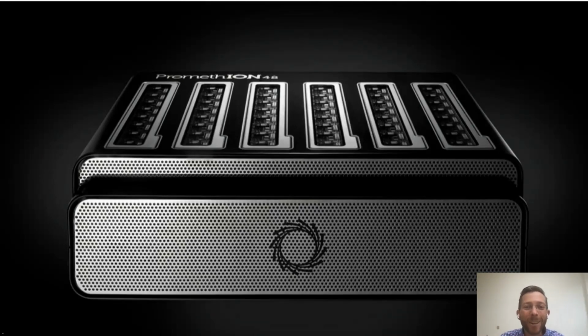And again, we can't really tell the scale of this, but really this is on the size of a desktop tower turned over on its side. So it's really quite small. And we can sequence a lot of DNA in a short period of time.